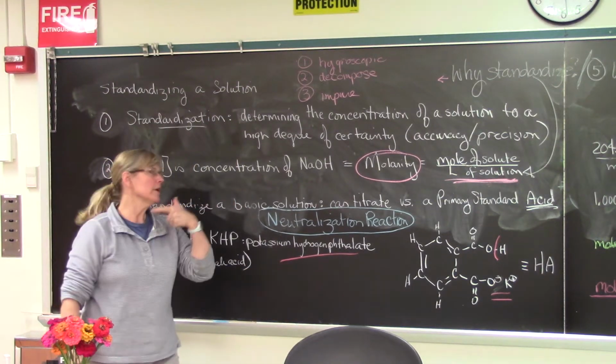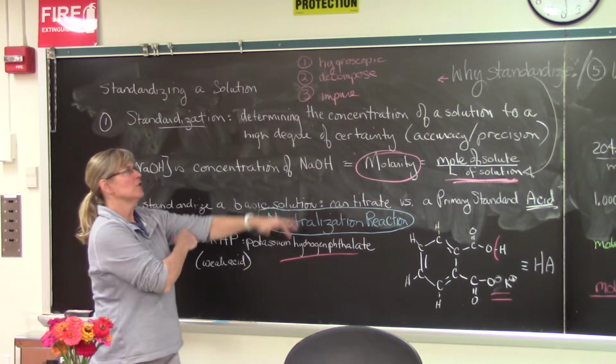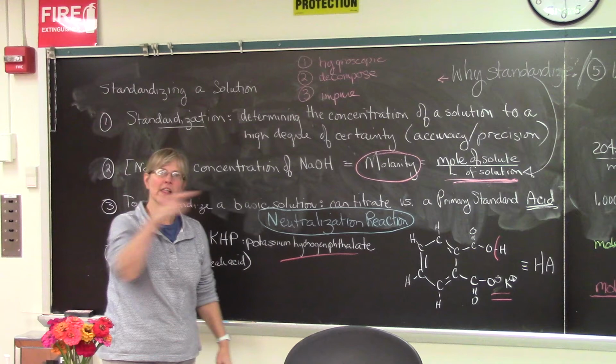High degree of purity, high molecular weight, very stable, and not hygroscopic. So let's see what we're going to do with it. I need to go this way.